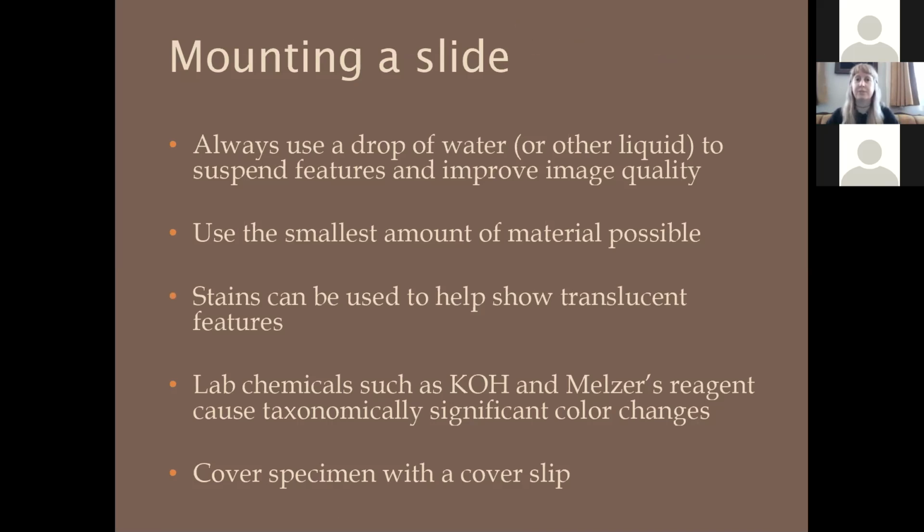Okay, so generally mounting a slide, here's what it looks like. You always want to use a drop of water or other liquid. Remember, I talked a little bit about using the potassium hydroxide. You might also use a stain of some sort. Using stains is a little bit more advanced, and there are various ways to do it.